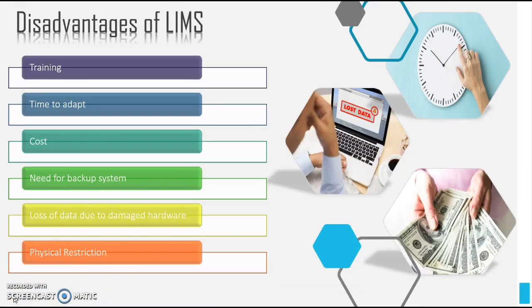LIMS cannot work without the availability of technology, so if a server is unavailable, then all related work will come to a halt until the server is restored. Implementing a new LIMS is challenging because the change is generally costly, disruptive, and can be unwelcome by individuals who use it in the short term and have to deal with it directly. However, one hopes that the long-term payoff will be improved effectiveness and efficiency within the laboratory.